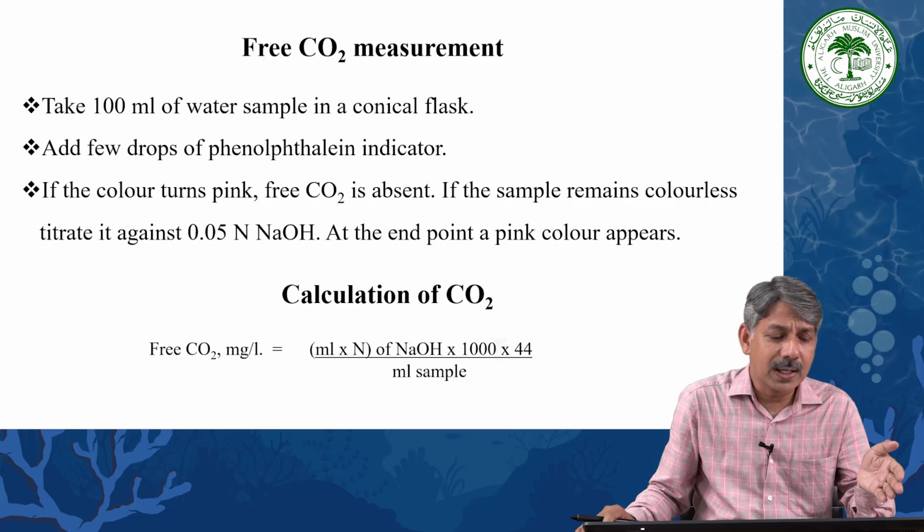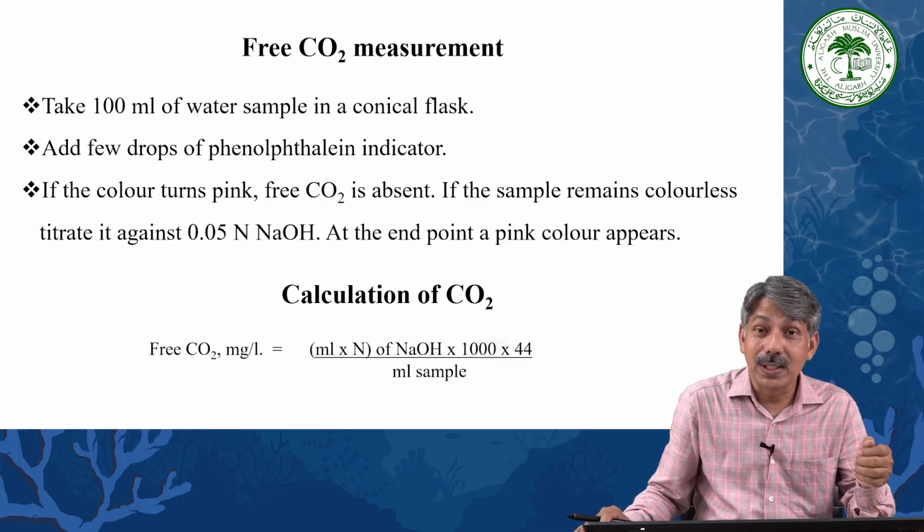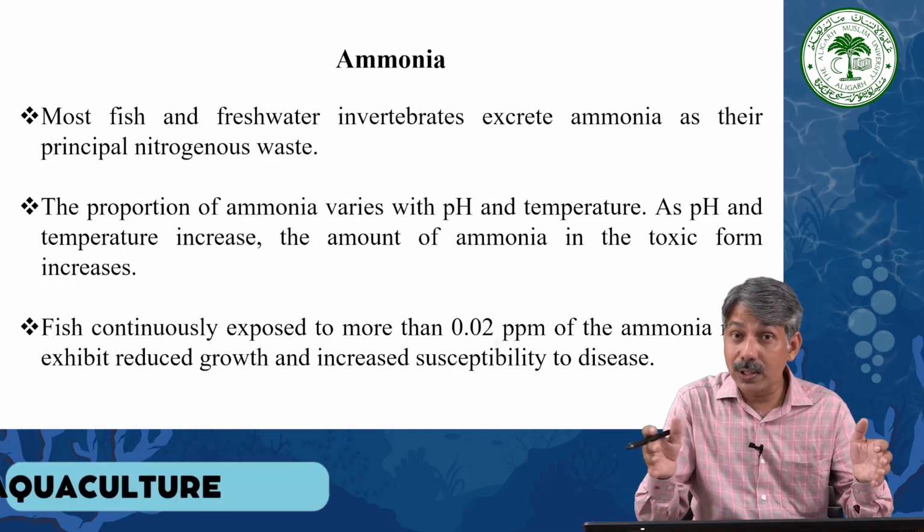This is how we go for very simple methods in the lab to measure free carbon dioxide, but a very important parameter to understand. This is a kind of warning that you have to take care of your pond water quality.